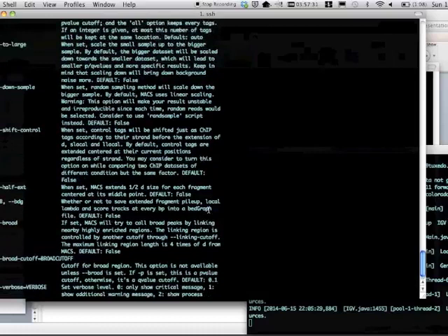It's worth pointing out that all these slurm scripts, which have an .sbatch extension, have to begin with the declaration of where the shell interpreter is located. In this case, we're using bash, and it has several arguments like the queue that we can send this to, how many nodes of the cluster we're planning to use, and how many CPUs and memory.